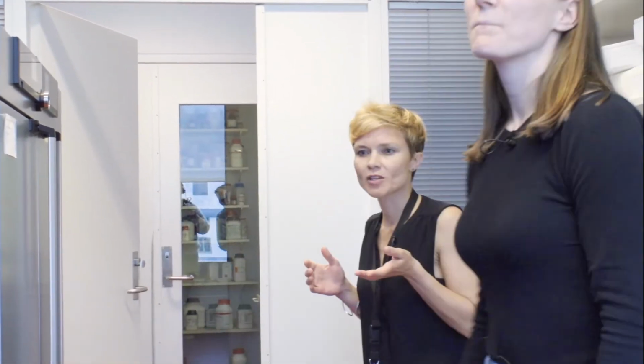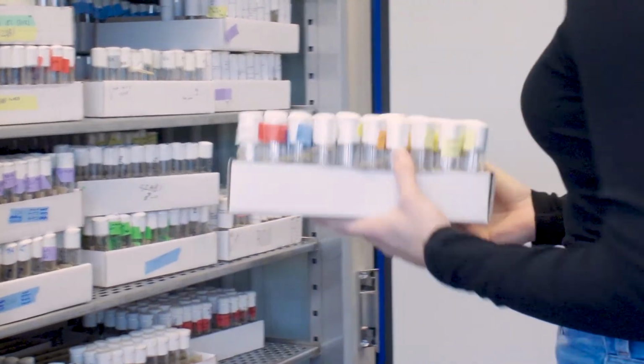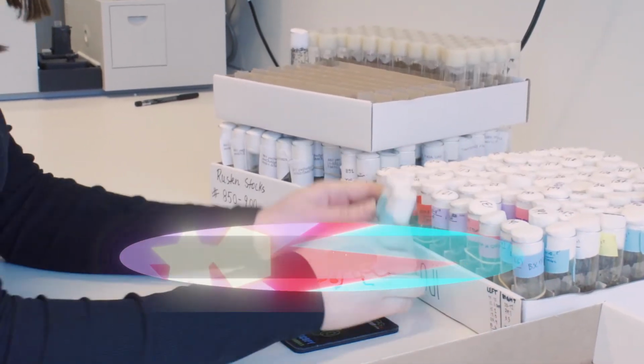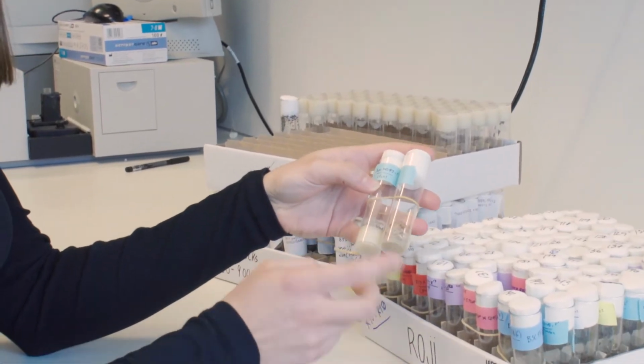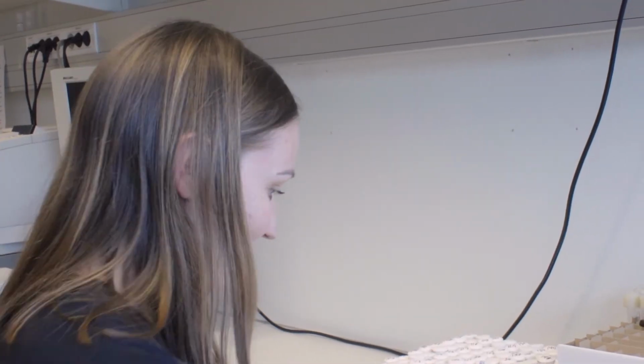One of the great advantages of the fly is that they don't take much space, right? No. So we can have a lot of them stored in a small amount of space. They are stored in this kind of box, and there are always 50 different ones. When they need new food, you have to flip them, which is basically feeding the flies. And then you have new food, which is here. And we have potatoes, sugar, yeast, and all the good stuff the flies like.